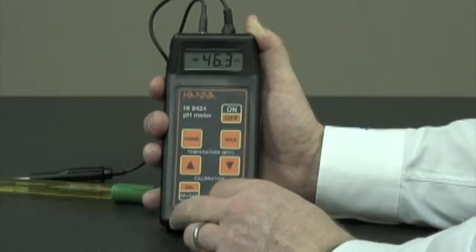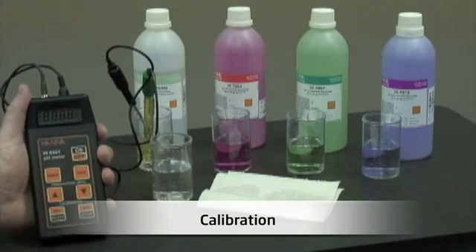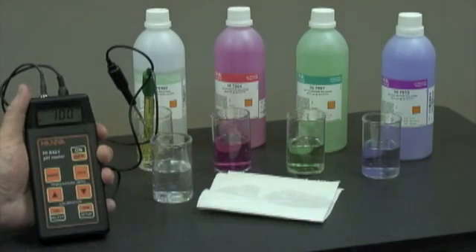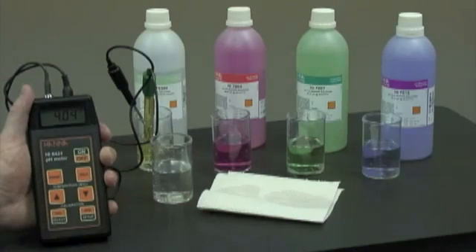Now I'll show you how to calibrate the pH probe. We'll turn on the unit. As this is a new pH electrode, we need to condition it. We'll use HI70300 storage solution, and we need to do this for up to two hours. If we don't have any storage solution on hand, we can use any one of our buffers.